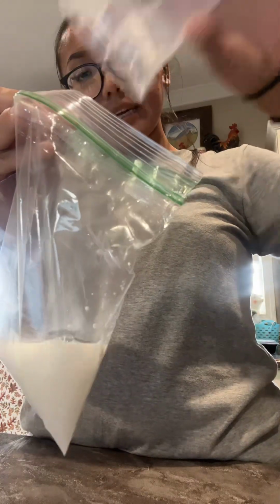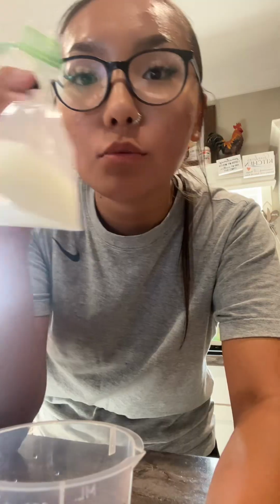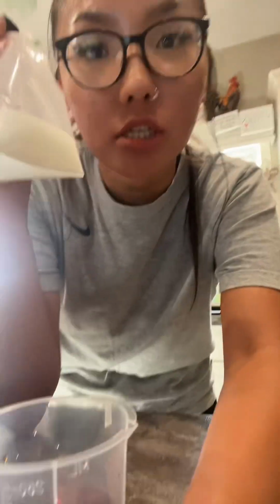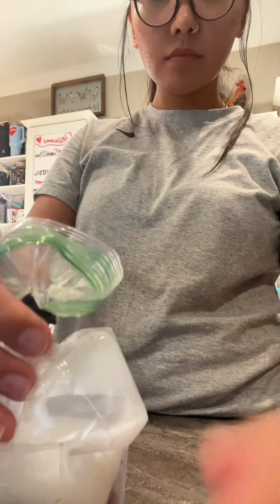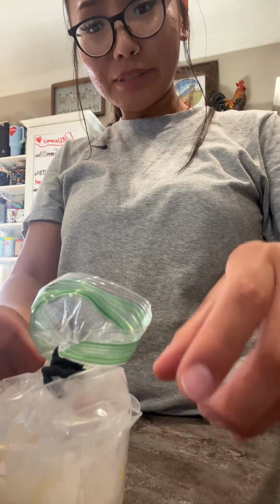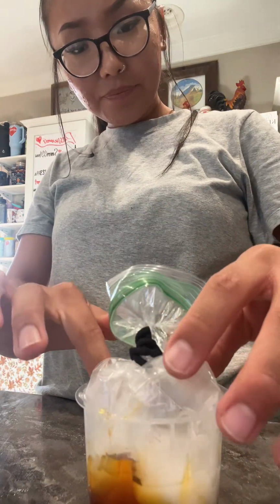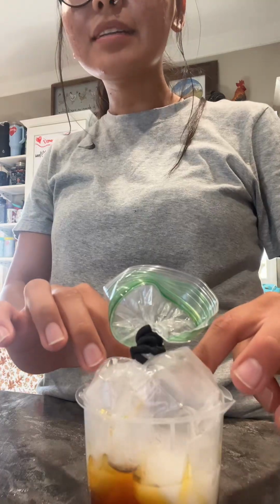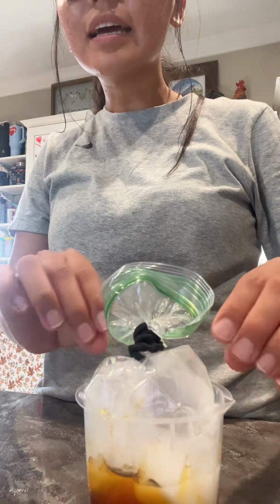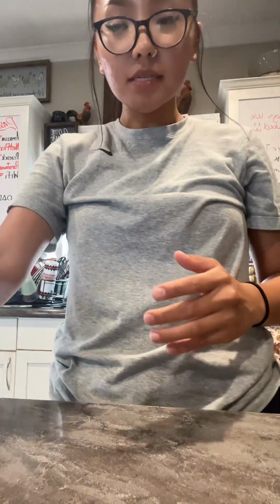And after you put it in, it says to tie it to make sure no water comes out of it. Alright, next we put this into the beaker. I kind of spilled. Should be okay. Alright, now we wait 10 to 15 minutes and I guess we observe what happens to it, so we'll be back. Alright, it's been 15 minutes now, so we are gonna see what it looks like.